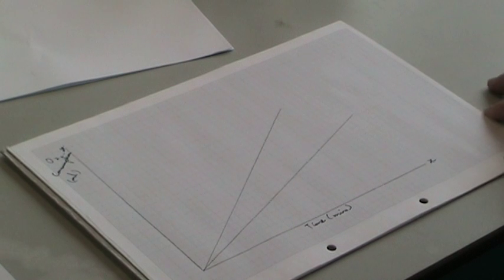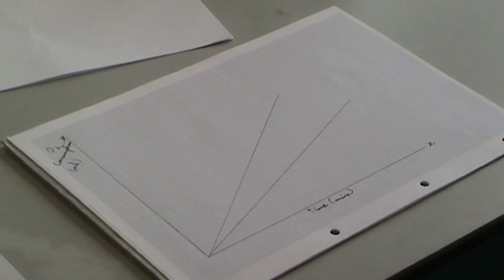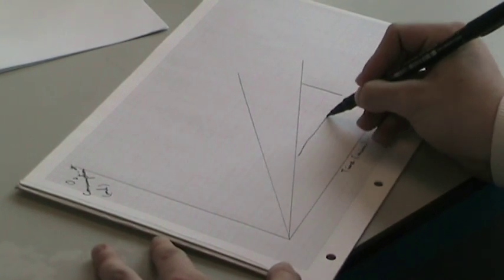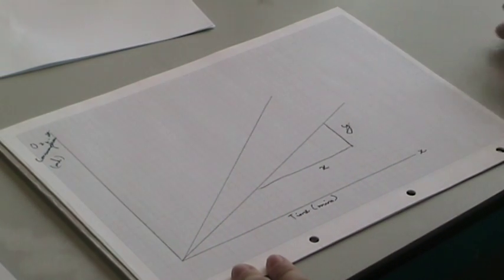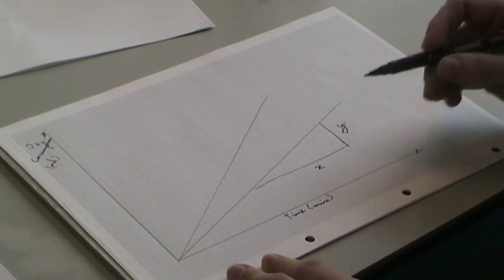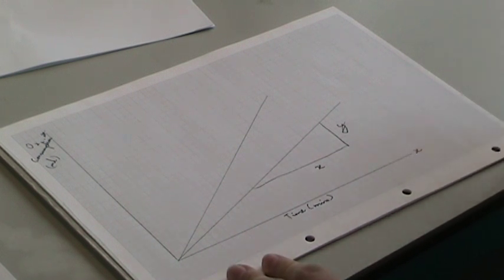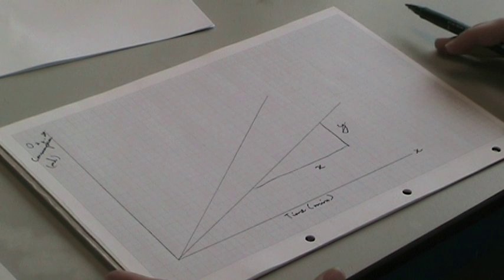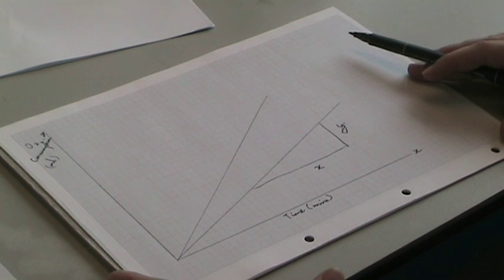it's just to explain. You'd have to calculate the O2 consumption rate at each temperature by dividing the Y value by the X value, Y over X. You have to ensure you relate this distance to the Y scale and the X scale, so the units will be milliliters per minute. You will have calculated the O2 uptake in milliliters per minute. However, the locusts are different weights, so you have to divide whatever value you get by the body weight of the locust that you used.